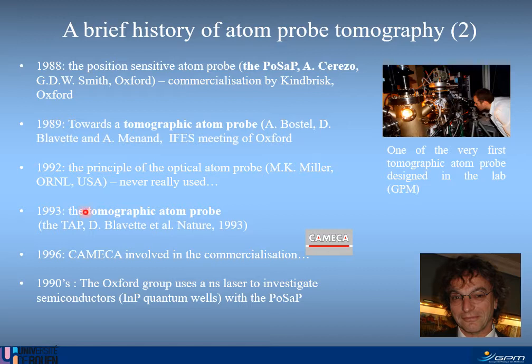93, this is the first applications of the tomographic atom probe presented in 89. This is the TAP, tomographic atom probe, and the first results were published in 93. 1996, Cameca was involved in the commercialization of this new instrument with the French group, with the GPM.